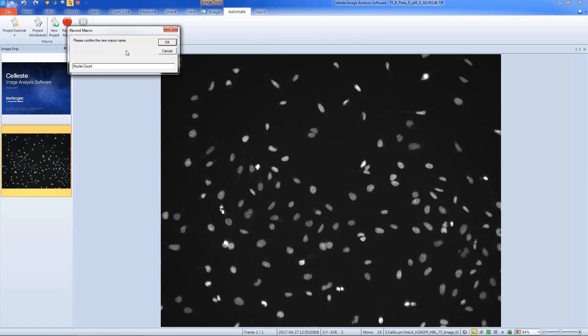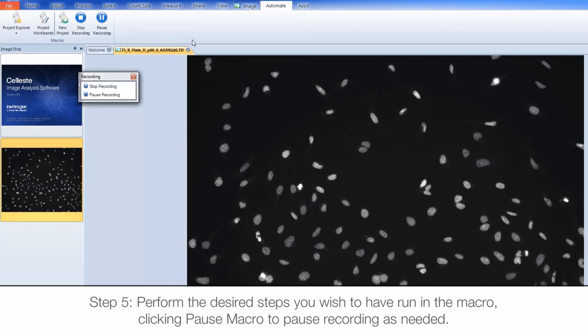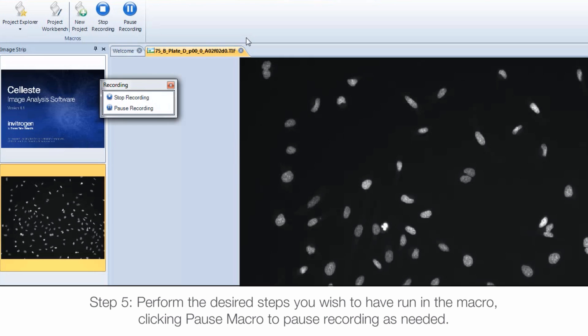From here on out, all steps you perform within Celeste software will be recorded. You can pause and stop recording using the recording window that is automatically popped up.